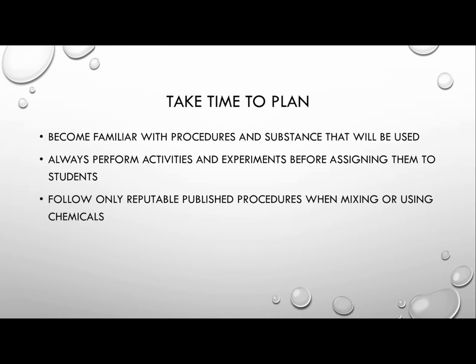in your classroom. You should always perform the activities and experiments before assigning them to the students. This will really help you with identifying any safety concerns, any alternatives that you might have to using something dangerous. But also it'll help you work out any problems. That way when the students come in, there's no frustration over trying to troubleshoot with the students all looking at you and waiting for you.